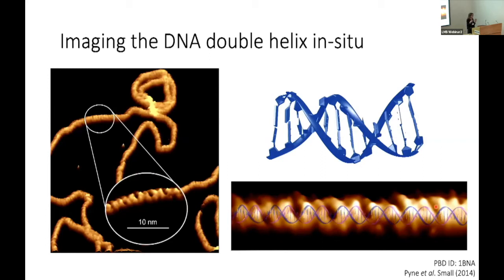We're seeing changes in that helical structure that we can only see by directly looking at one molecule. We lose this when we start to average. So that's the great thing. We can see variation in a single molecule of DNA, and we can see the helical structure, and we can resolve back the correct pitch and things like that. But the thing you might have noticed is this is quite a lot wider than the crystal structure. The DNA isn't suddenly 5 nanometers wide.